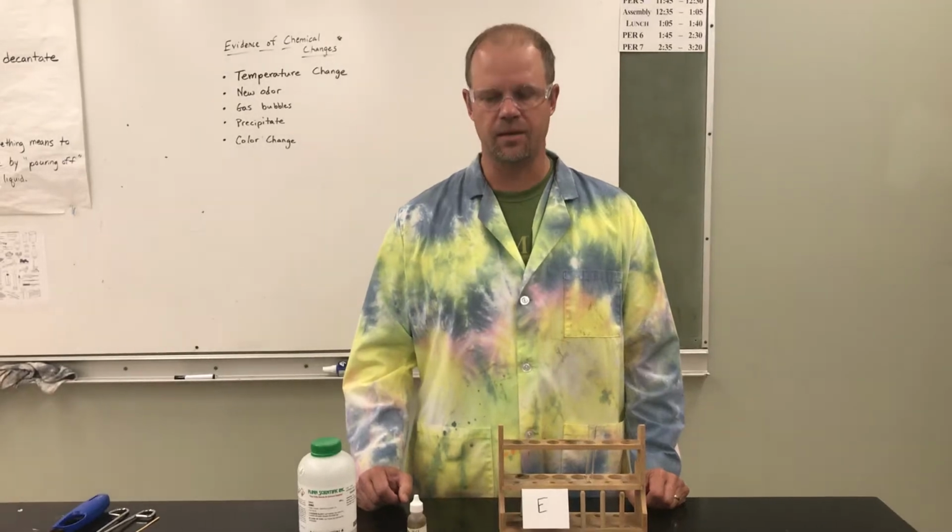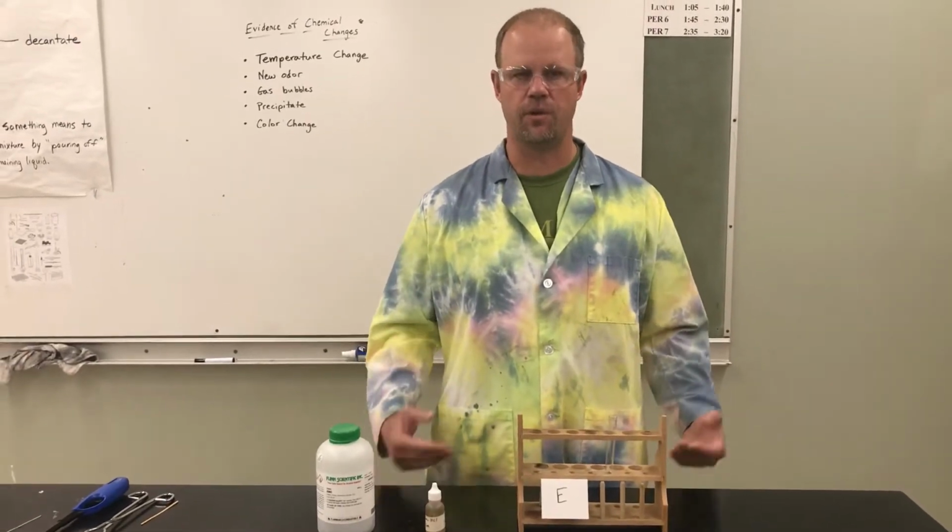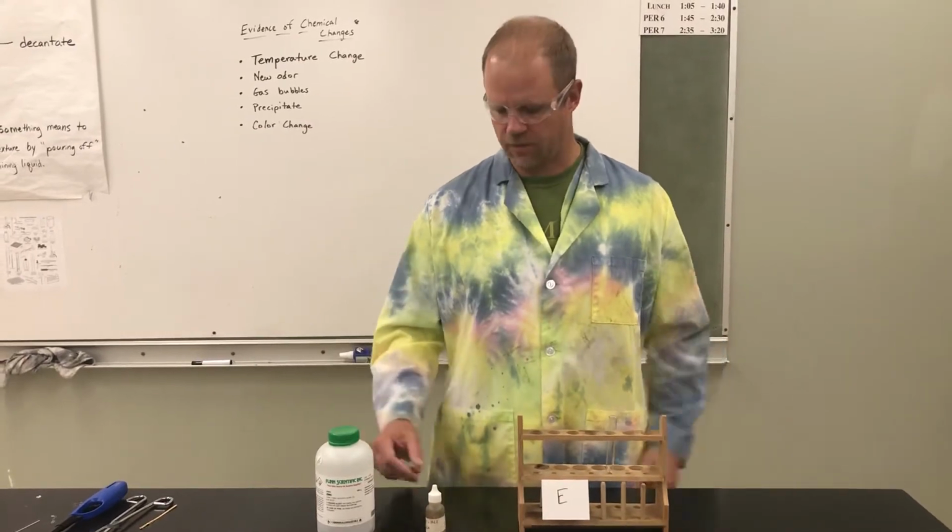This is experiment E, and this is the last one. It actually has two stages to it. We're going to do two different possible changes. So let's talk about the first one.